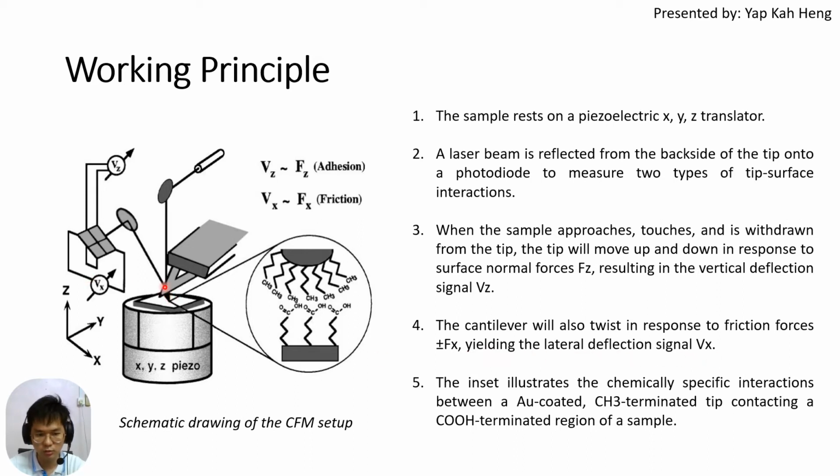So other than moving up and down, the tip can also move in the x direction, so that we can get the friction force. And once we get the friction force, we also can get a signal Vx.